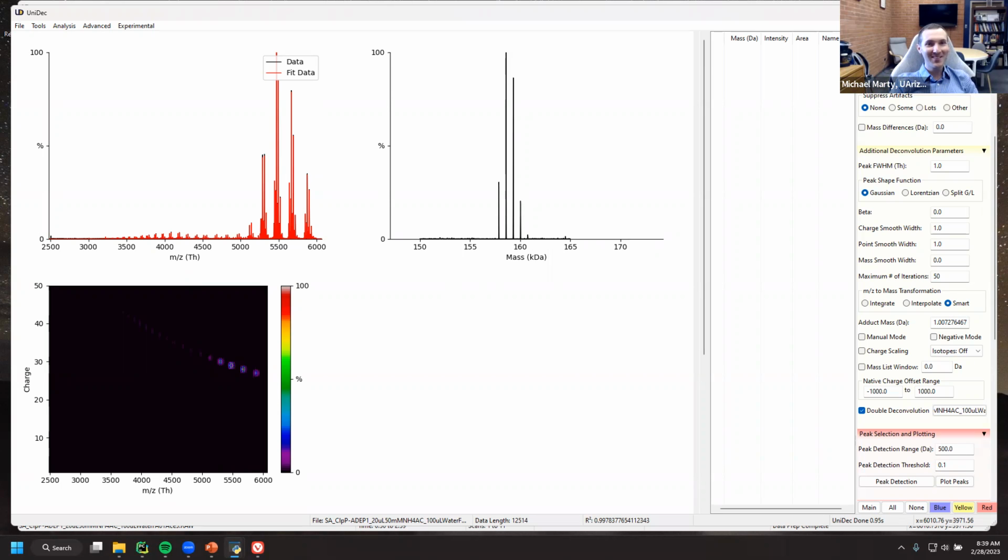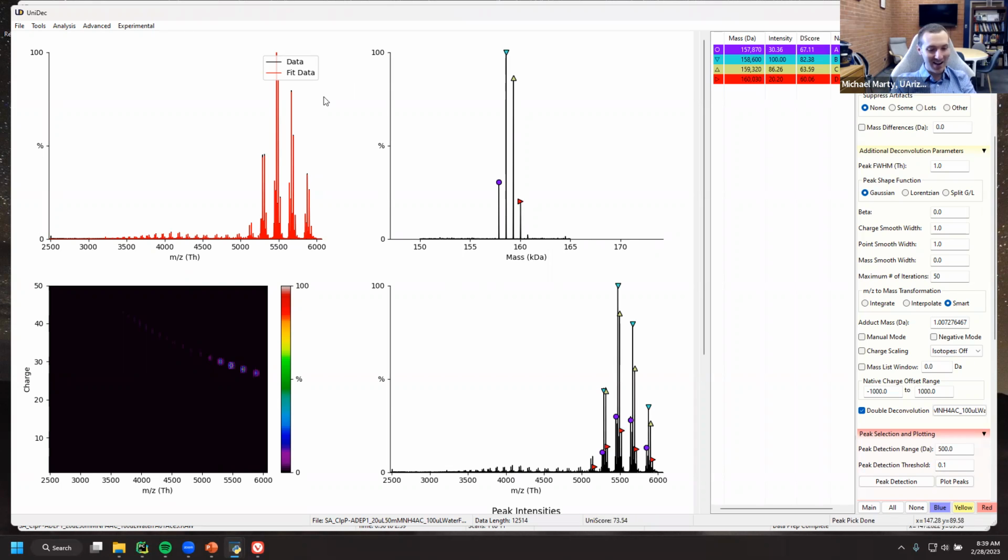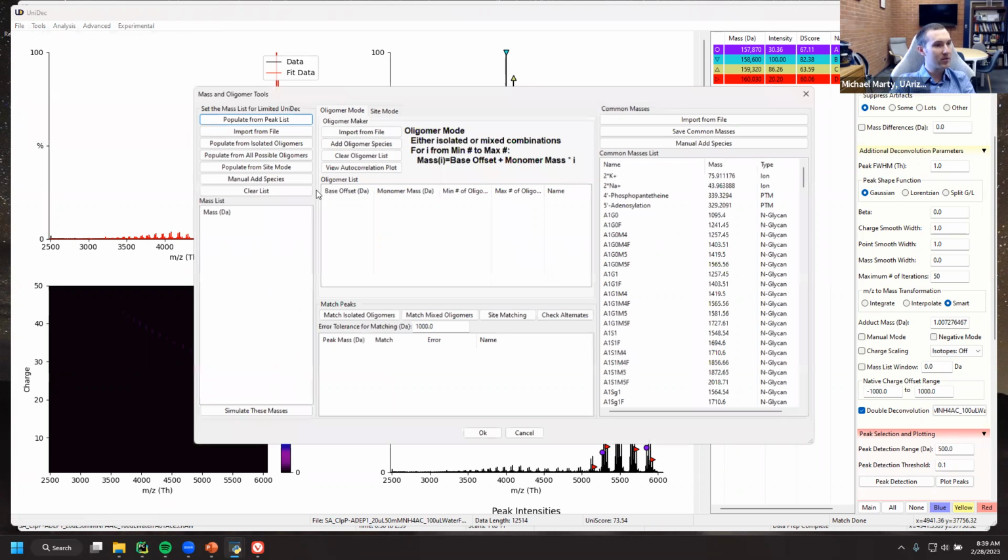It looks beautiful, right? It's always nerve-wracking doing live demos because you never know when you're going to have a Microsoft moment and it's just going to fail. So I think I'm happy with that. Now if we do Control M, we can match against the things that we have. Sorry, we lost our things. 22550. This was our P, and we had the other one, which was 719 up to 7.